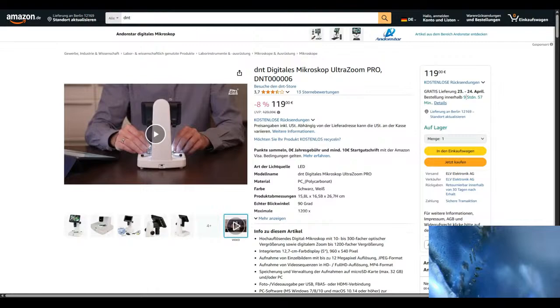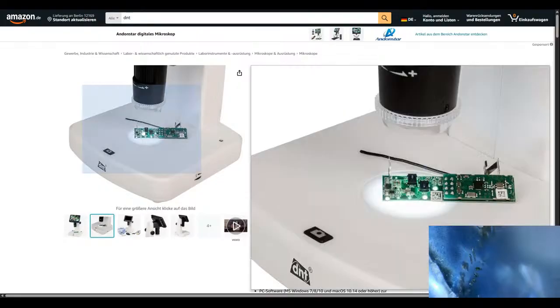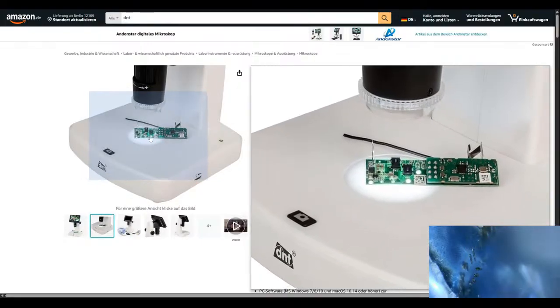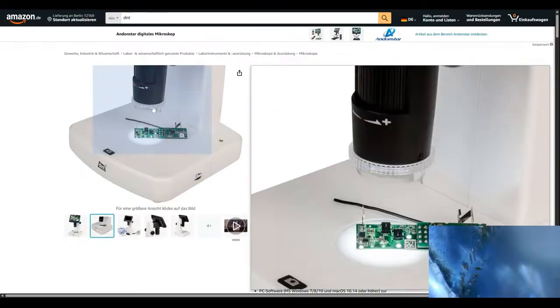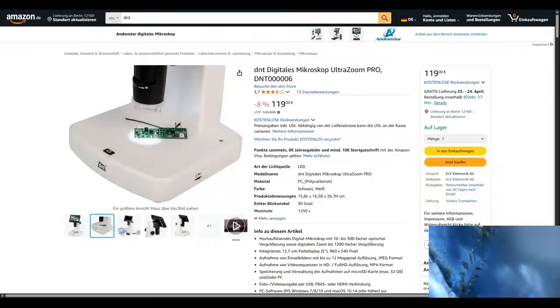I mean, you don't even need dark field. If you get into what dark field is, it's mainly used for biology. It's quite complicated also. With gemstones, it's very simple. All you need to do is make the middle part black down here. Turn both lights on, and you have pretty much dark field illumination. Kinda, not really, but it gives a similar effect, right?